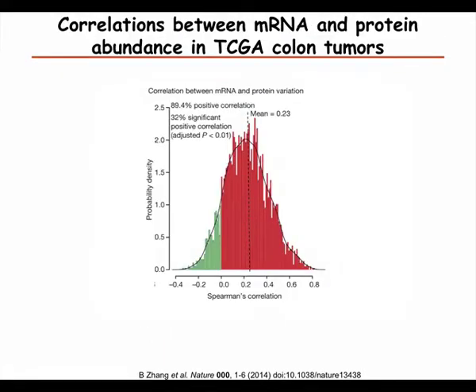Sorry, does that mean that the record has low correlation scores? Does that mean we don't have a measurable amount of mRNA and proteins? No, the only data included here was the ones where there was measurable amounts of both. Usually mRNA is measured for almost everything where we have protein measurement, but not all of it. When we don't have a protein measurement or no RNA measurement, those were removed. So these were the only ones where both measurements were non-zero.